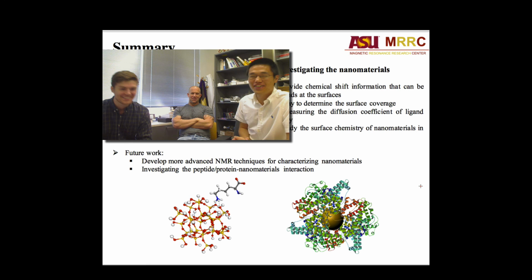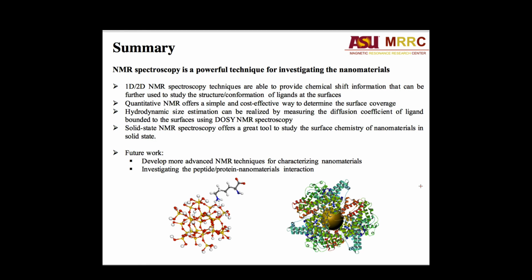Yeah. And also we want to investigate the peptide and protein capped nanomaterials, and we think that's a trend to make the nanomaterials more applicable in the future.